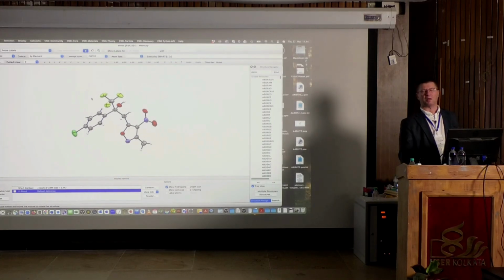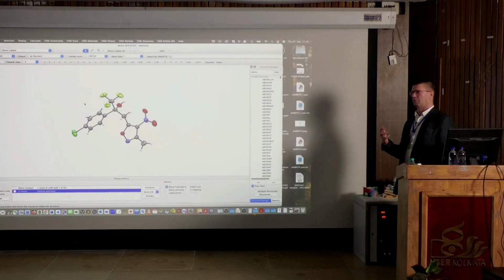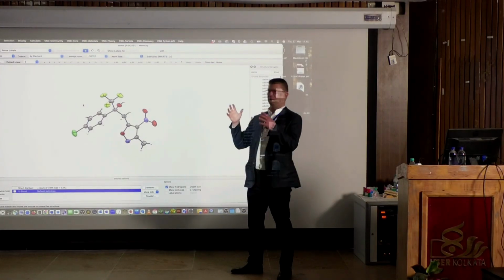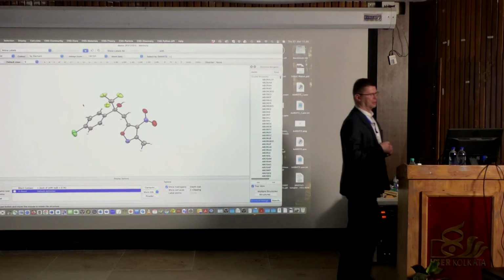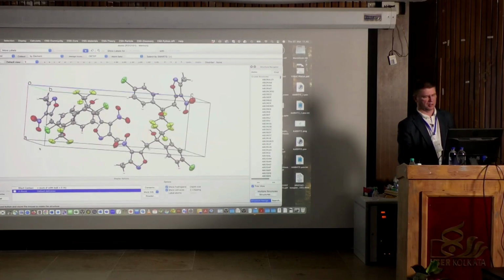The point is that if I would like to see more of what happens, the other form is this. I can look for the interactions, but if I want to see the whole thing, where are the other atoms? That's the packing. And the packing is actually, there is a knob here on the left-hand side, say packing, like this.